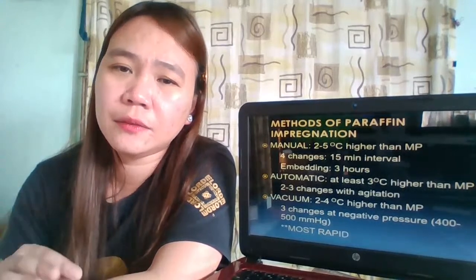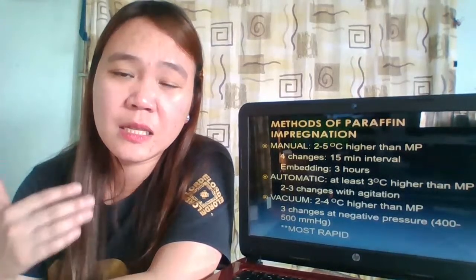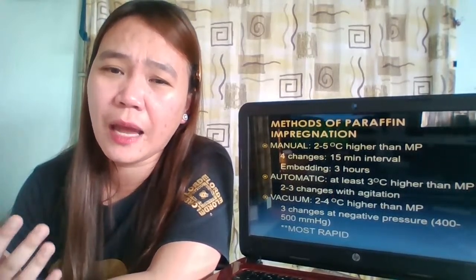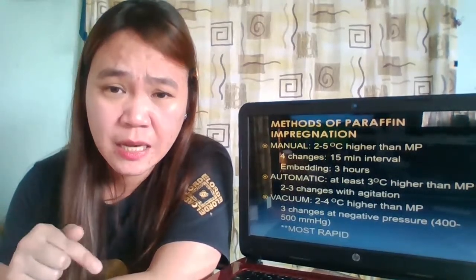Actually, yun ang tinitignan natin when we perform infiltration. It's the exposure of your tissue sample to heat. Yun yung kino-consider natin. Hindi naman dahil paraffin is damaging in itself.